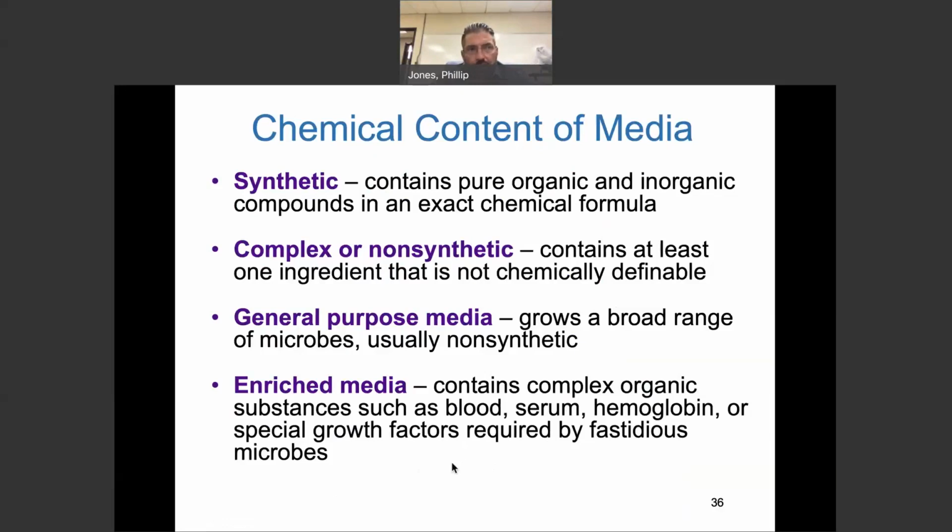Then we put it in a little chamber and drop a little votive candle in there, pull all the oxygen out of the environment, and that strep is happier than happy. And I did some Tuesday, so I think next week I'll come back and I'll show you beta hemolysis on that plate, alpha beta hemolysis of that Strep pyogenes. I think I used one, and then I literally swabbed my throat.